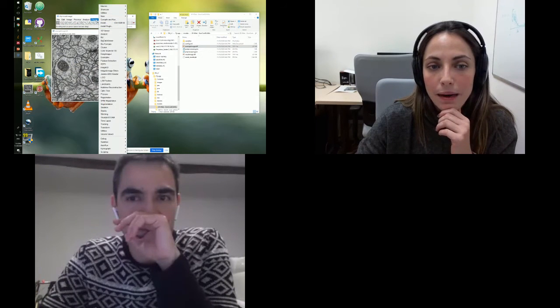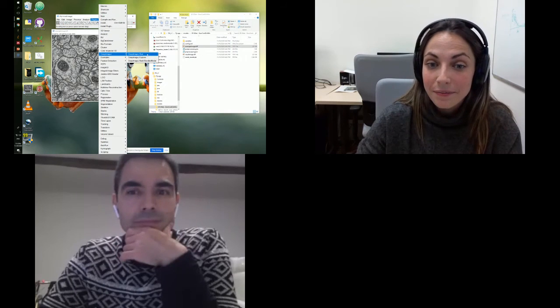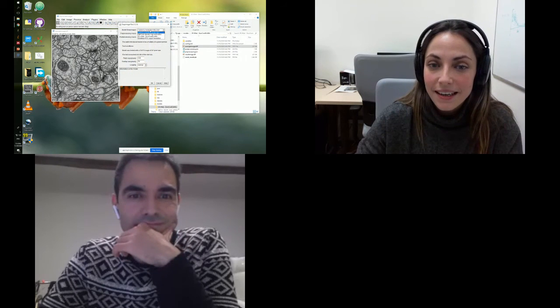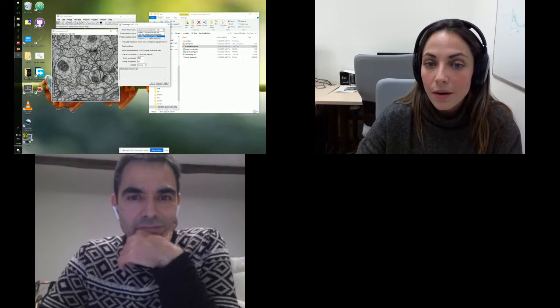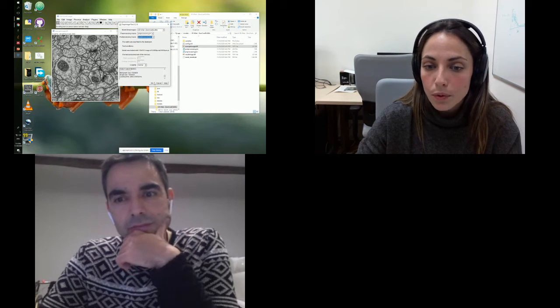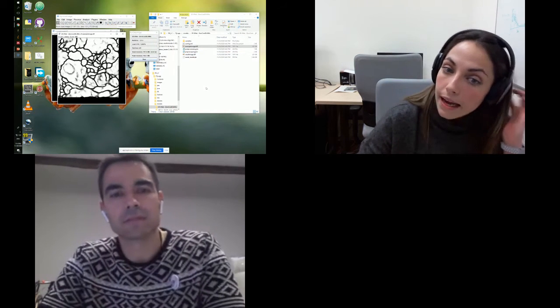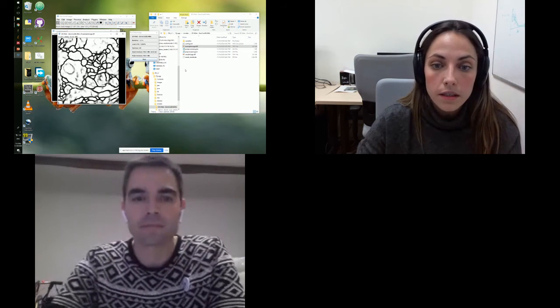And I can go to Plugins, DeepImageJ, DeepImageJ Run. Here, I choose the model that I want to use, that is the one I just downloaded. I choose to apply the pre-processing given by the developer, the post-processing, and I click OK. And it just takes a few seconds.